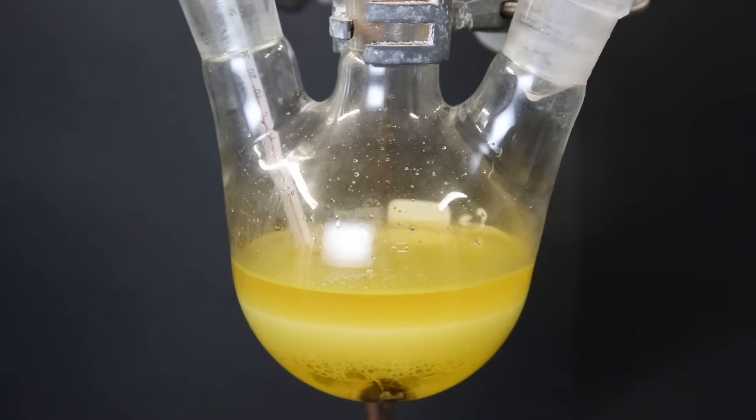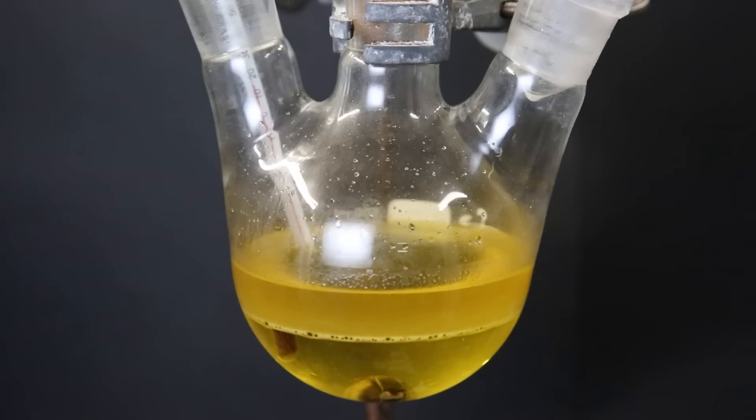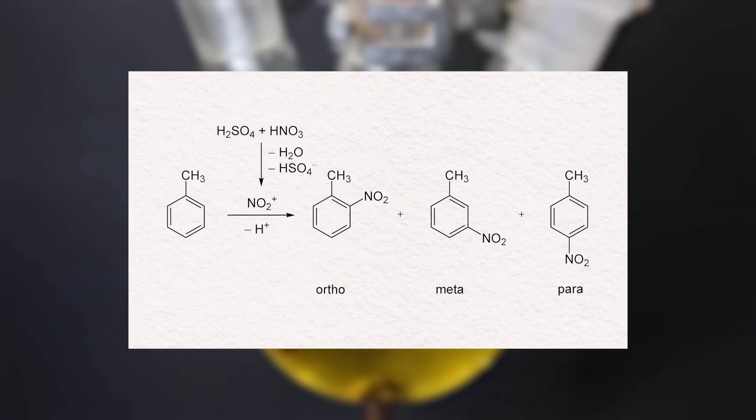I remove the flask, and we can see that instantly two layers start to separate. Here the bottom layer is the acid and the water, and on top of that is a mixture of mononitrated toluene isomers. Because toluene has a methyl group, the distribution of these isomers is heavily favored towards ortho and para isomers, because methyl groups are ortho-para directors. That doesn't mean that no meta-isomers are present, but it is less than 5%, which is not very significant.